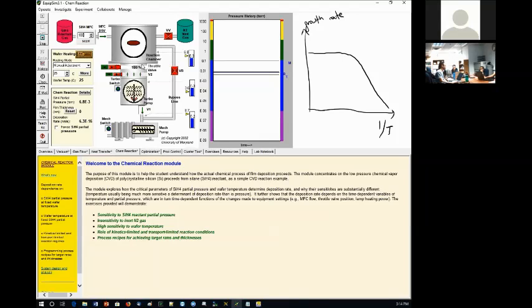All right. Now, under these conditions, first, temperature heating is 25 degrees. That's the first temperature we're going to look into. And I will turn on the temperature heating. Let's just switch to manual adjustment. That's the easiest one. Instead of waiting for temperature increments, we'll just set 25 degrees. And then we'll keep an eye on the film thickness, the deposition rates here, okay? So what does it say? 6.3 times 10 to the minus 16.